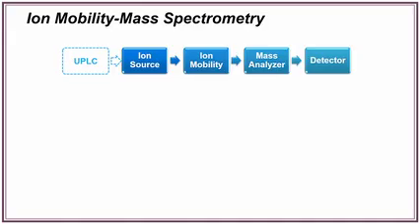And it sits before the mass analyzer. What's really nice is that you can couple this to MALDI, you can couple this to chromatography, or any other front-end separation you'd like to do. It could be supercritical fluid chromatography. Those are all potential upfront separations that you could incorporate and still have ion mobility data.